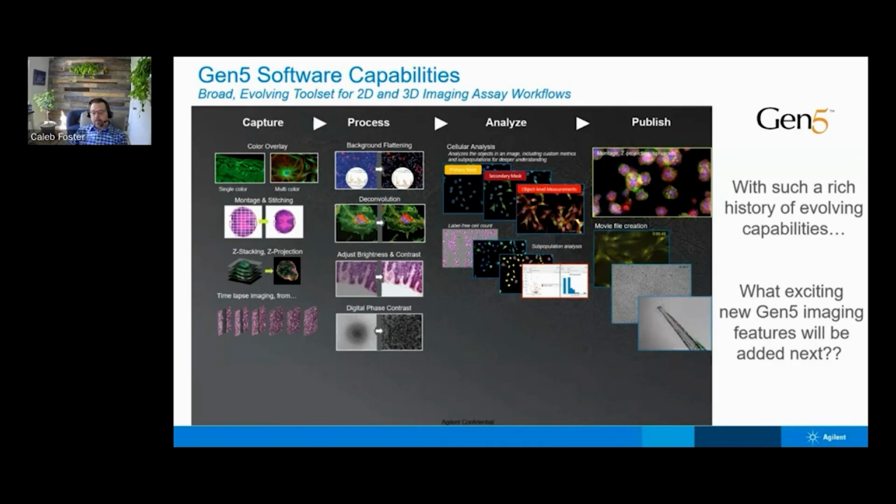How do the Agilent image analysis tools you covered fit into the future imaging and microscopy lab? Yeah, that's another great question. There are a lot of needs today that are going to be there for decades, and the tools that we have support a huge majority of our customers today. We want to continue to expand on that and follow these new trends like label-free applications.